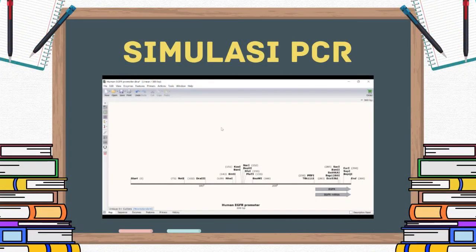Sequence for the human EGFR promoter region. What I want to do is to design PCR primers that will add restriction sites to either end of this sequence so I can use this fragment in restriction cloning. Specifically, I want to add a site for Acc65I to the beginning of the sequence and a site for XhoI to the end of the sequence.